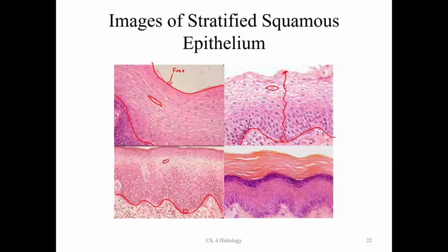Now here, that's a lot of keratin. This is keratinization right now. You can see that these cells are basically so dead, so thin and flat, you can't really see them. You can start to make them out right here. As they keratinize, this is full of keratin, and this is like my skin right here. This is skin. I wanted to pick one that was keratinized. I wanted to get one with keratin.